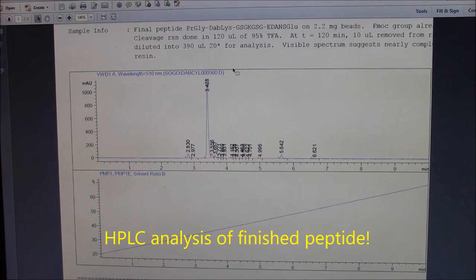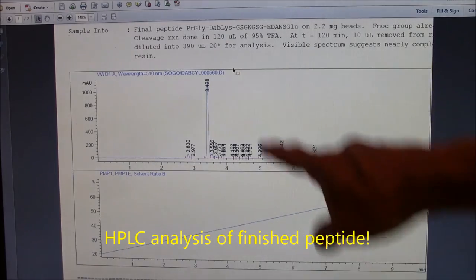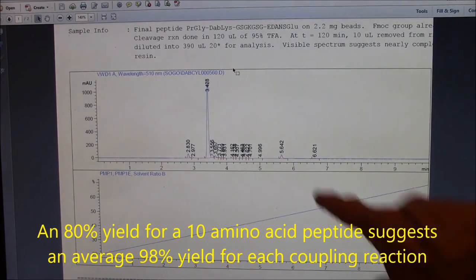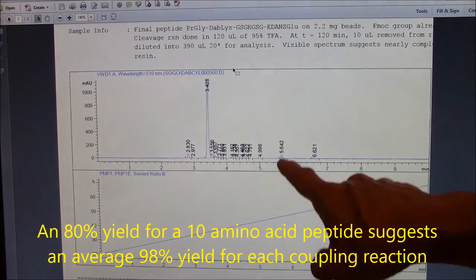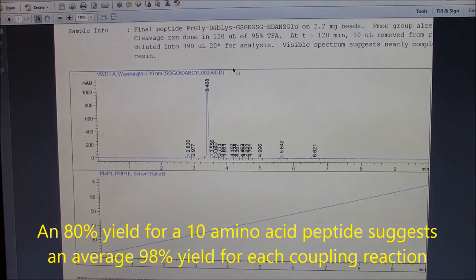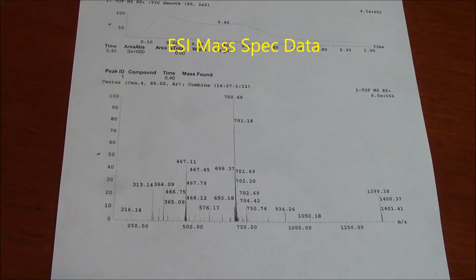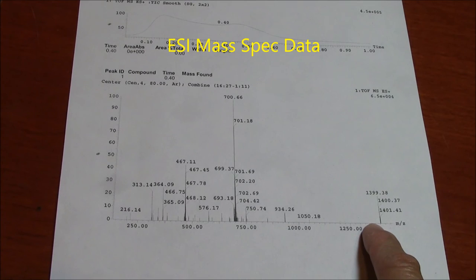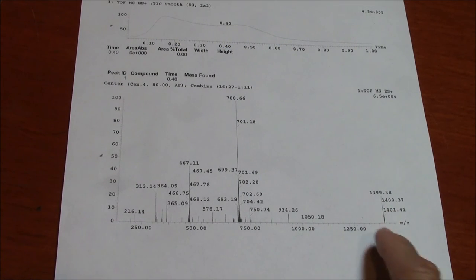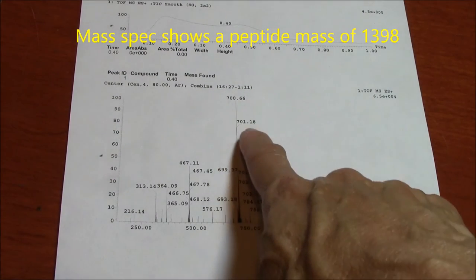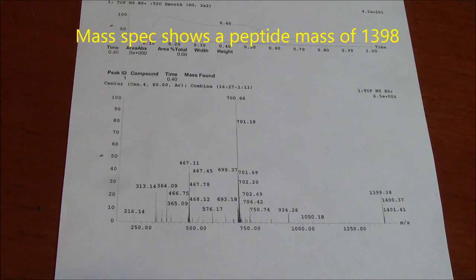Here's the HPLC analysis of my finished peptide. One major peak here, this is 80% of the area, a couple 5% peaks here and here, don't know what those are, but it looks good. This is electrospray mass spectral data from the peptide, showing a peptide mass of 1398. This is plus H. This is the doubly charged peptide with two hydrogens attached and it looks great.